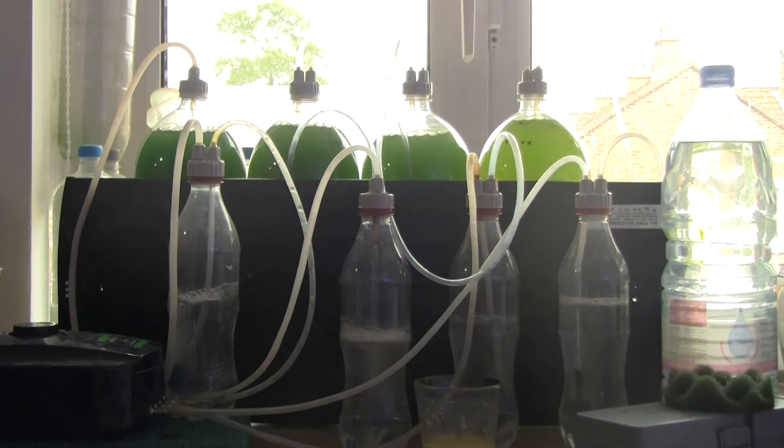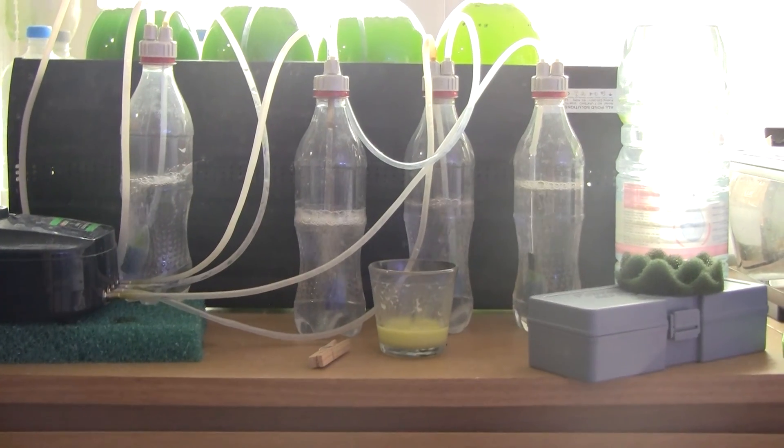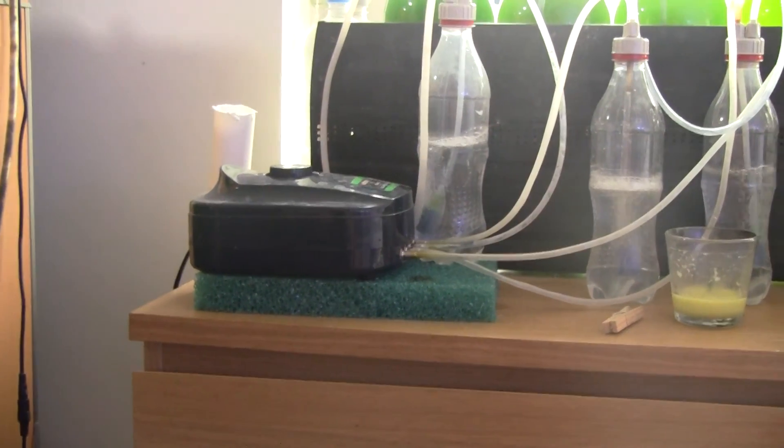So there it is: four different species, separate, four air filters, and a powerful air pump. That's about it.